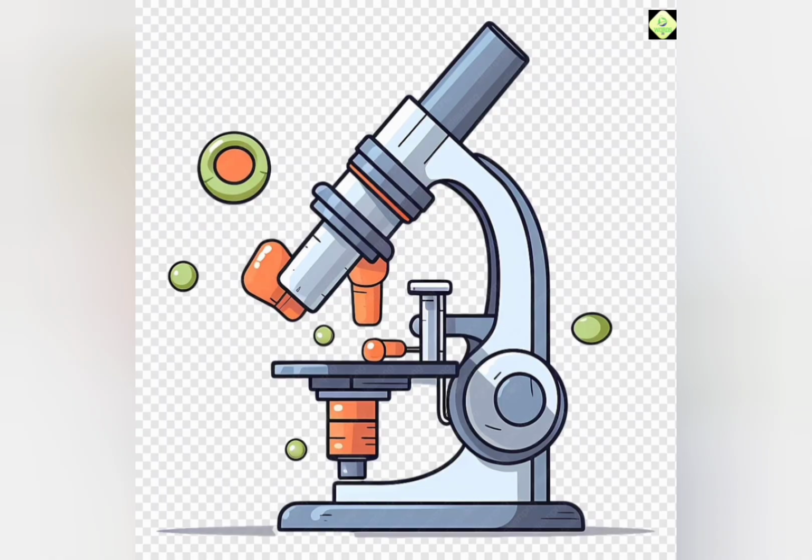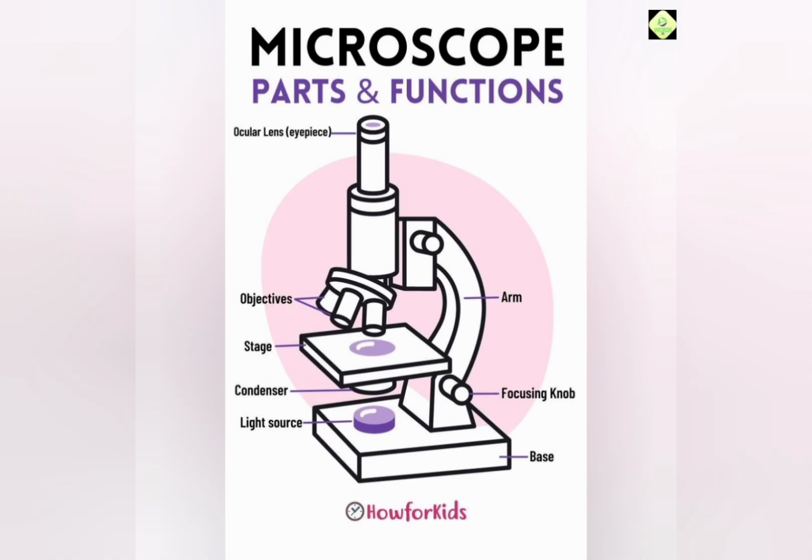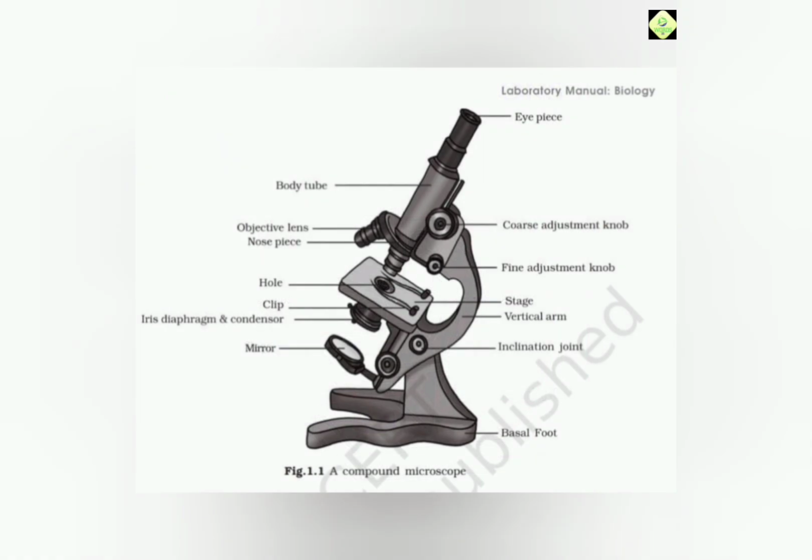First, optical microscopy or light microscopy is the microscopic technique that uses transmitted visible light, either natural or artificial, for developing the image of an object. It is the most common type of microscopy. It is further classified into several groups: bright field, dark field, phase contrast, fluorescence, and confocal microscopy.